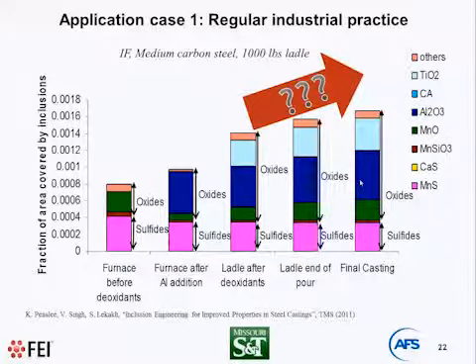Also, we have titanium oxide or titanium nitride, which is difficult to differentiate, but we have this type of inclusion. And also, we have increased manganese and silica oxide sometimes, which indicates reoxidation. The problem is, when we did this measurement and discussed it with foundry metallurgists, we found that we did not have the right trend of change in non-metallic inclusions.